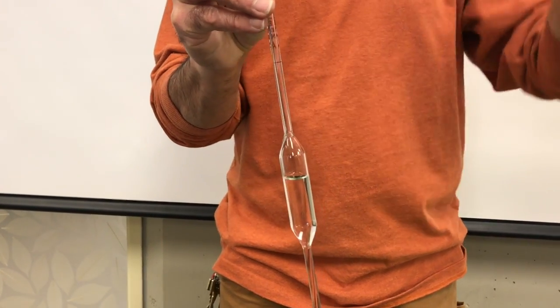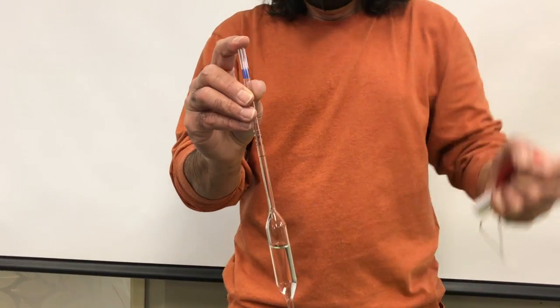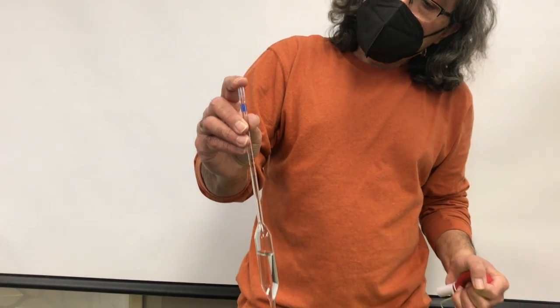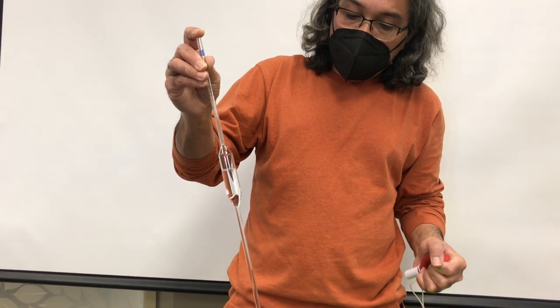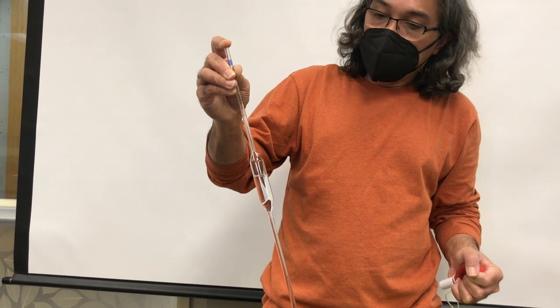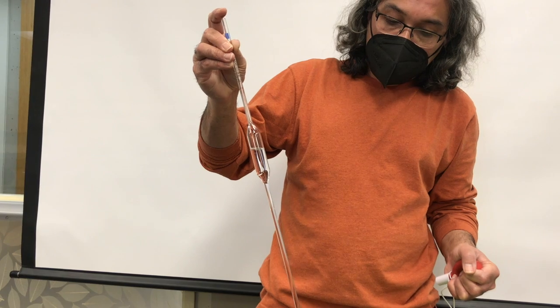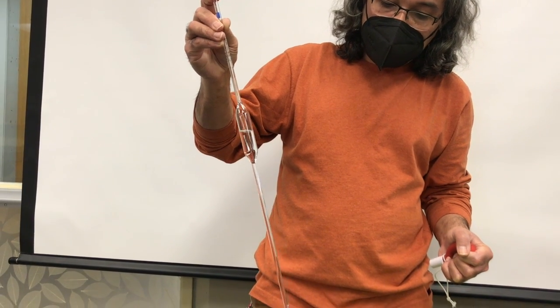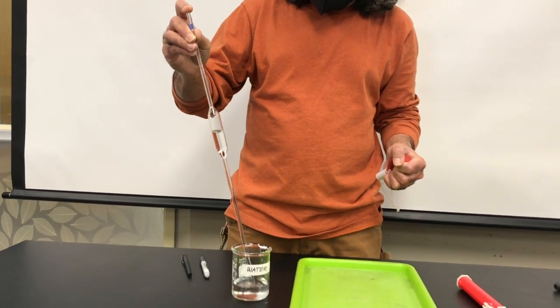Oftentimes, you're going to have to do two pumps to be able to fill it all the way. So notice how I'm using my index finger to close the end of the volumetric pipette so that no liquid comes out of it. If I was to release the vacuum, then liquid will come out, but then I just use my index finger to keep the liquid from coming out.